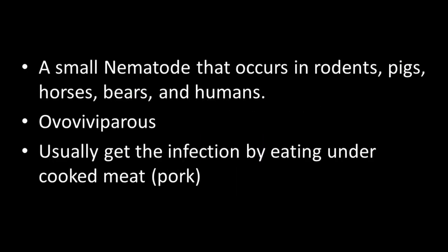Trichinella spiralis, the pork worm. This is a small nematode that occurs in rodents, pigs, horses, bears, and humans.